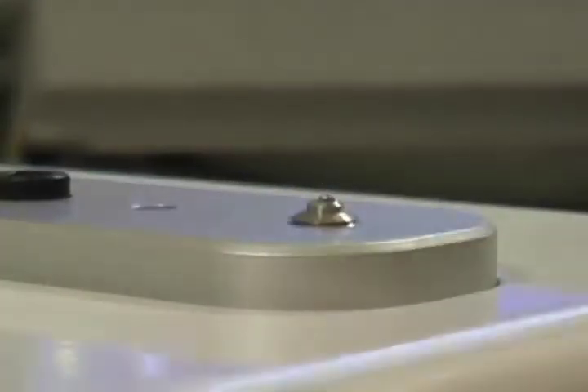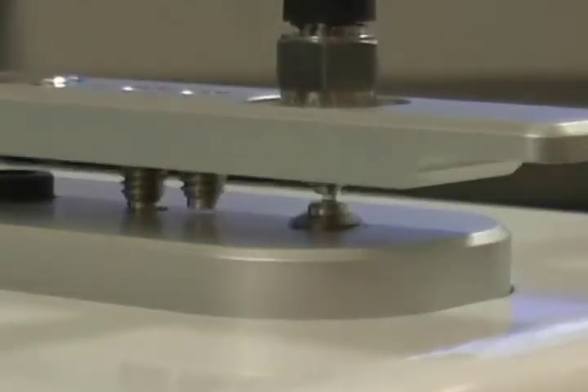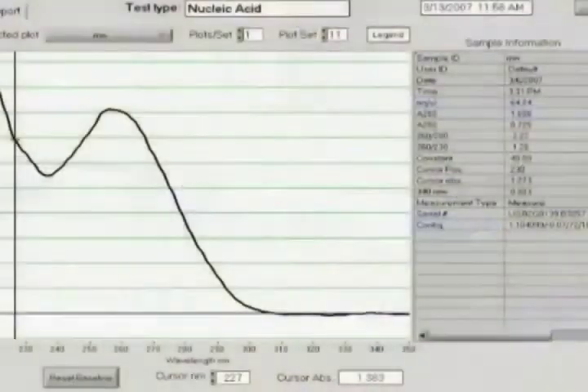Only one microliter of sample is needed to quantify the RNA using the NanoDrop spectrophotometer. To calculate the RNA concentration, absorbance is measured at 260 nanometers.